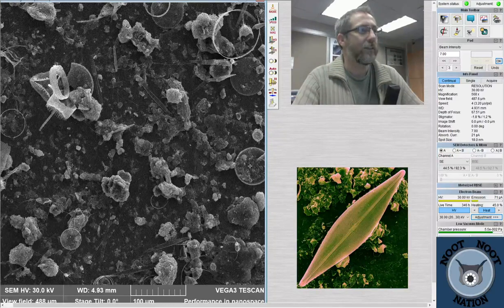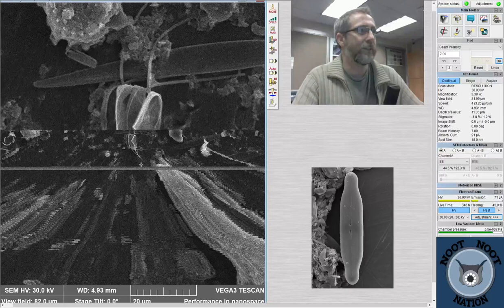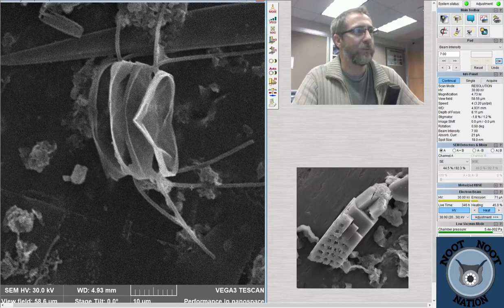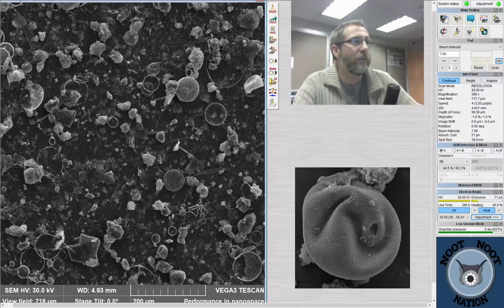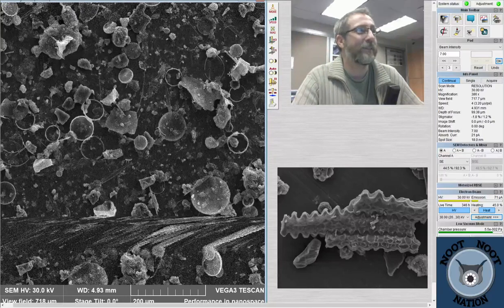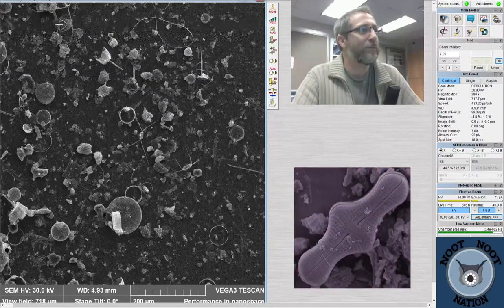So it's one of the cool things about learning to identify diatoms or whatever is that if you can find the characteristic components that define a genus, then you can put things into those pretty easily. So some more of these little skinny Chaetoceros right here, a whole bunch of them stacked up next to each other. But if you know what to look for, which it's the marine stuff, so I probably don't in many cases. It's not my focus for my research or anything, but it's easy, sort of, if you know what to look for.